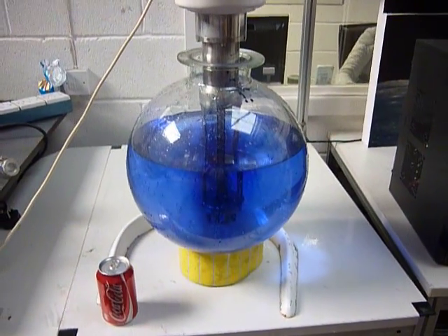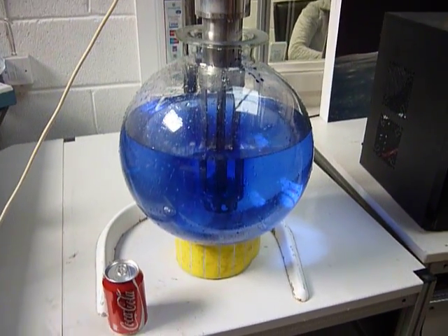Okay, this is Nick Edmond from Richmond Scientific demonstrating the Silverson emulsifier.